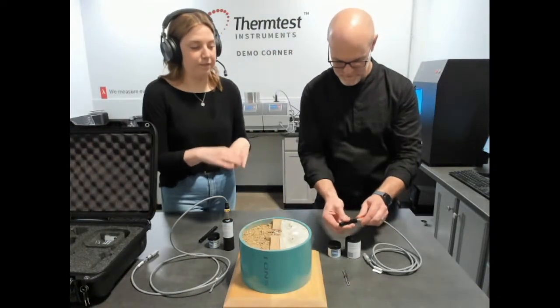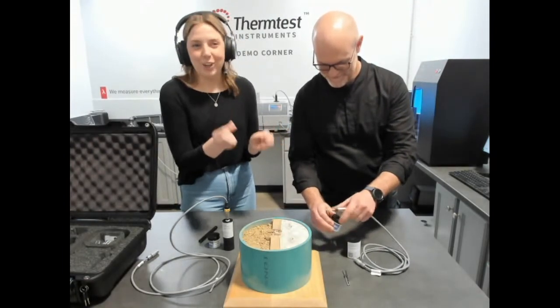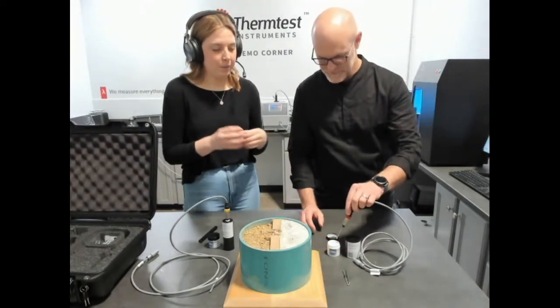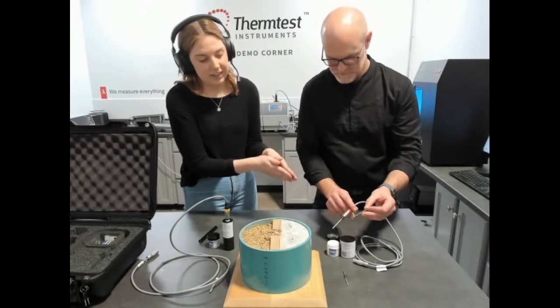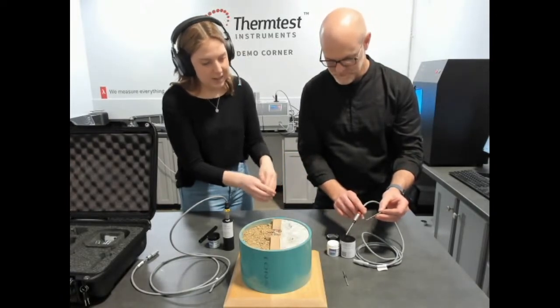Moving on to the TLS 150 — TLS 50, sorry. This needle is shorter with a larger diameter and it's just for measuring samples that are more rigid and more difficult to drill. Similar method: we would just dip the needle into the thermal paste and then insert it into our nylon verification sample and make measurements that way.